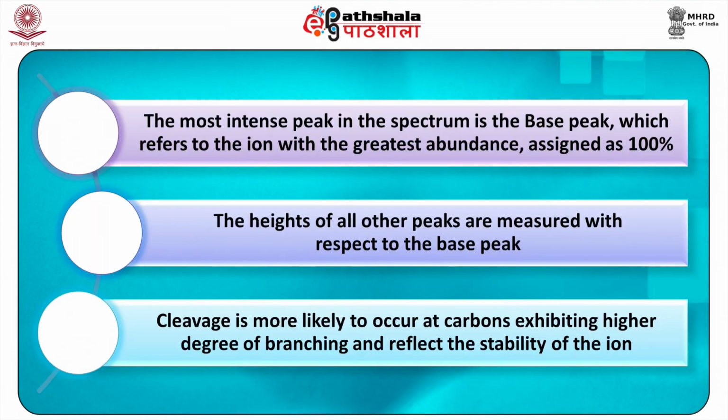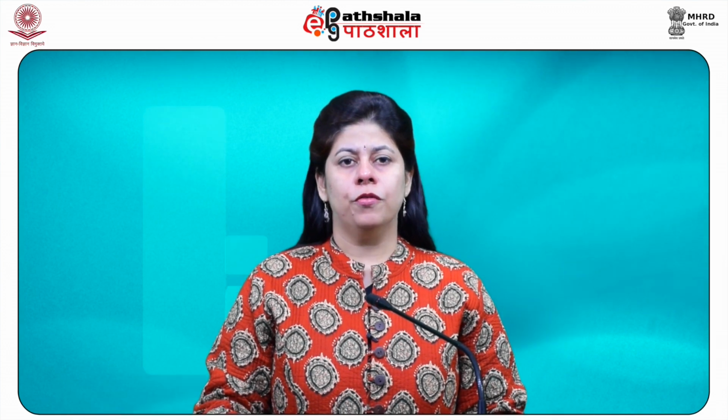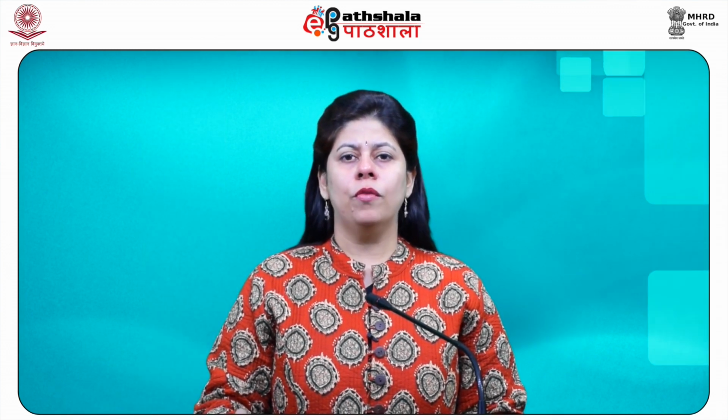The most intense peak in the spectrum is the base peak, which refers to the ion with the greatest abundance, assigned as 100%. The heights of all other peaks are measured with respect to the base peak. Cleavage is more likely to occur at carbons exhibiting a higher degree of branching and reflects the stability of the ion. The structural information about the molecule can be obtained from the fragmentation pattern of the mass spectrum.